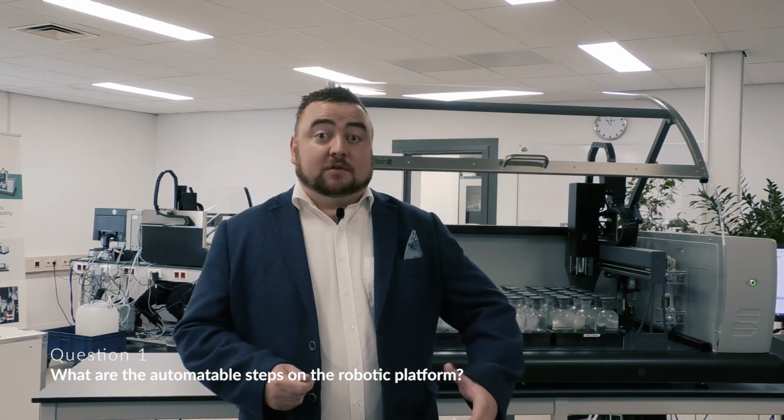So, question 1, what are the automatable steps on the robotic platform? Keeping in mind that within the theme of automation there are of course different levels of automation, semi-automation all the way up to, say, total automation. So number 1, dilution water addition. This is based on the idea that the operators have manually pipetted the samples into the dilution bottles themselves.